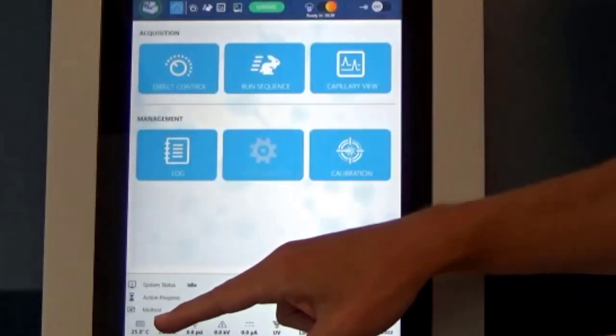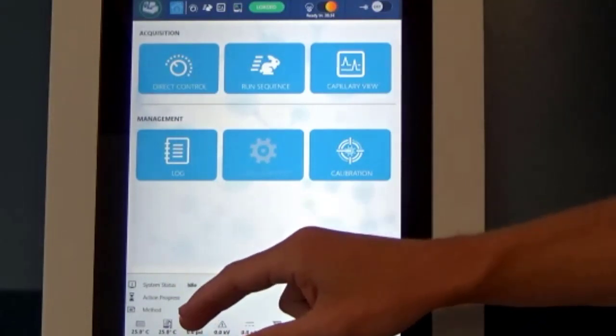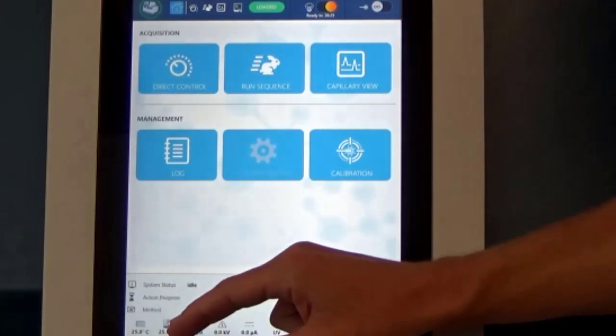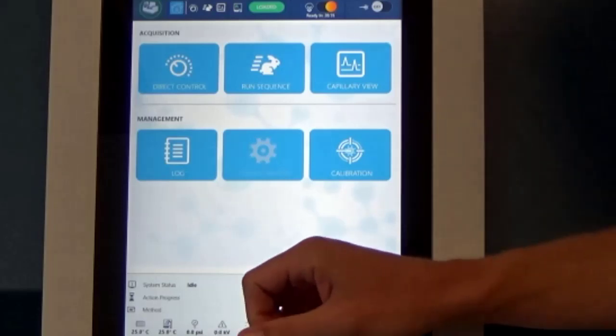On the bottom, we can see exactly what the system is doing at any time. So the system status currently is just idle, how far it is in any of the rinse actions it's doing, type of method it's running, the sample temperature, cartridge temperature, applied pressure, applied voltage, generated current, et cetera, et cetera.